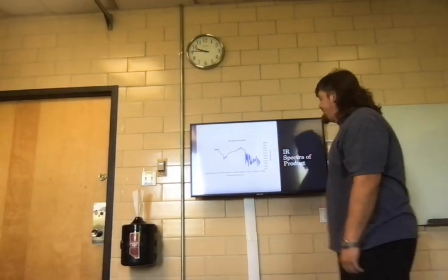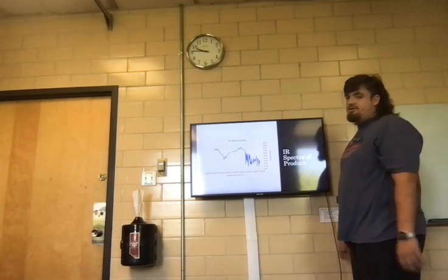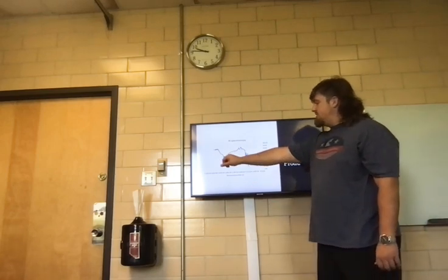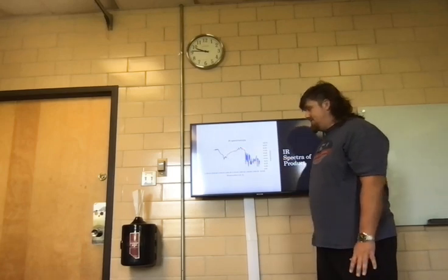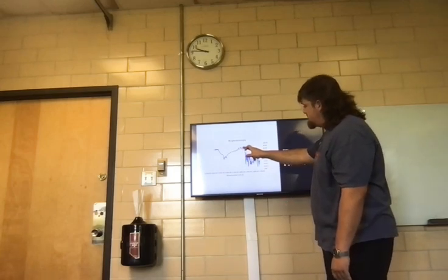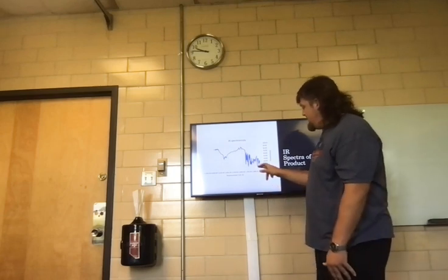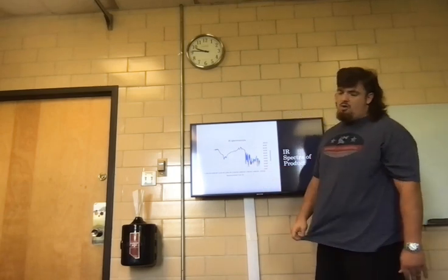And lastly, the last part of our data, we took the IR spectroscopy. From this, we were able to determine that we did successfully produce our target product. From what you can see here, these are our C bonded to our H's, single bonded to our H's. Here, this bond around 1750 shows our C double bonded to our O. These little dips right around 2000 prove that we have an aromatic compound. And this long peak right around 1500 is our NO bonds.